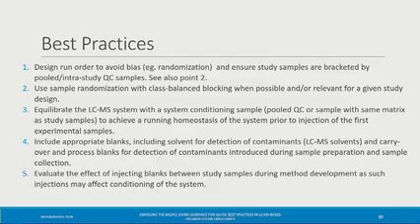Yes, I have a question on the system suitability because we established a mix of standards about 3 months ago in our lab, and I remember at the time we were asking ourselves, for example, for the same instrument, we have 4 different columns that are run across the methods. And we were wondering, should we use this mix of standards each time on each of the columns to also control for retention time drifts and so on, or should we just rely on the pressure? Or instead of that, should we have one specific and short column with a fast method and just run the system suitability always with the same column before running your batch on your application?